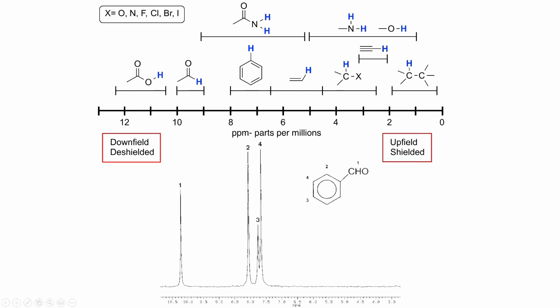Because we can cut this molecule in half and have symmetry, the two hydrogens on these sides are equivalent, so they should give us the same signal.